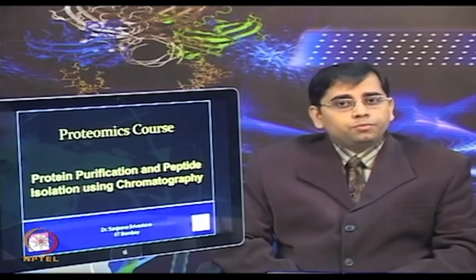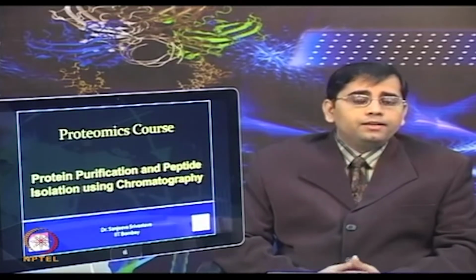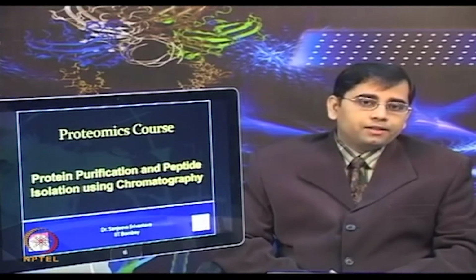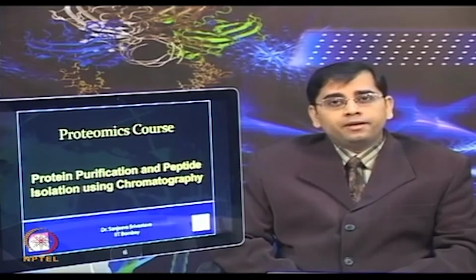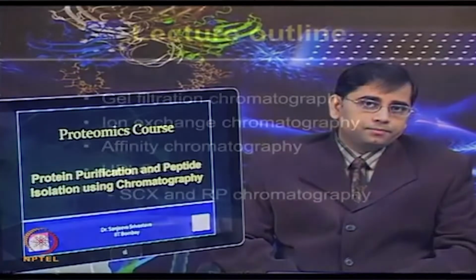From a complex proteome, it is challenging to purify a protein in a single chromatographic step. Therefore, sequential pre-fractionation steps involving different modes and types of chromatography methods are becoming necessary for proteome level analysis.